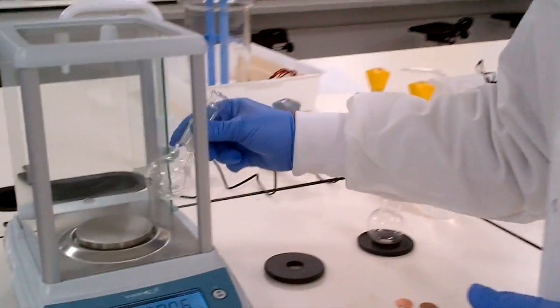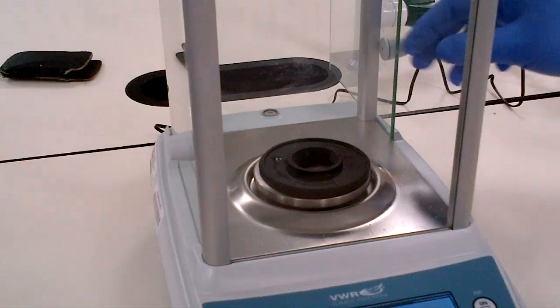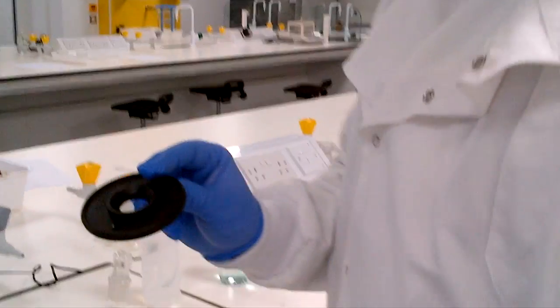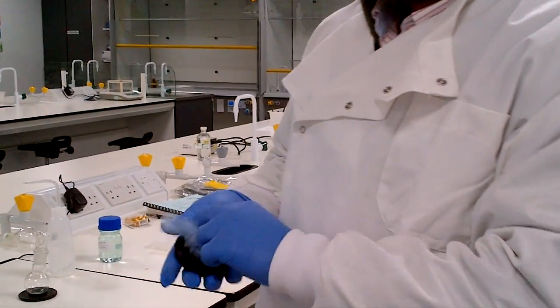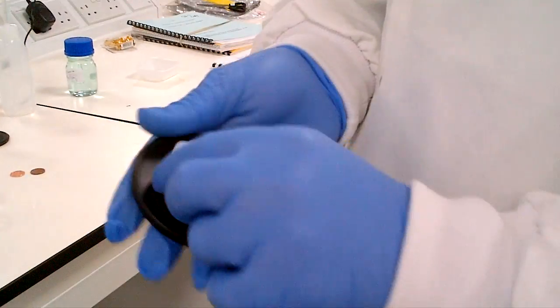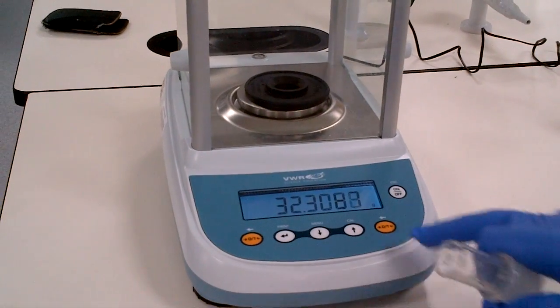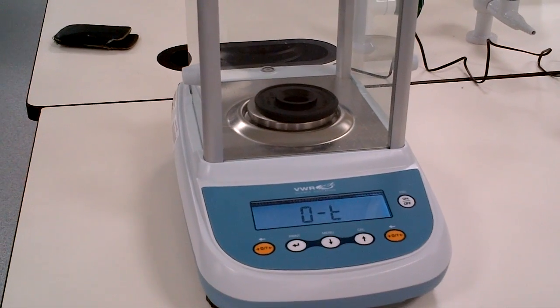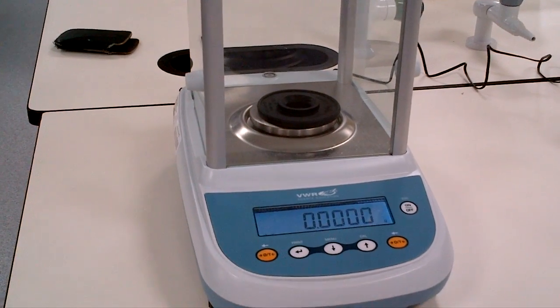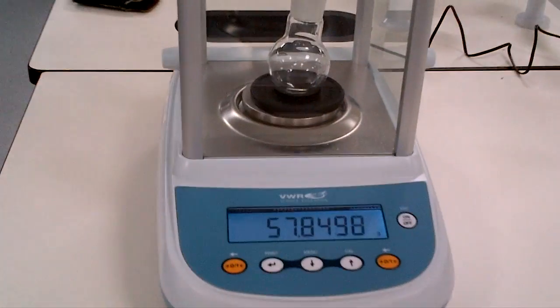You can't weigh a flask like this onto the balance, it will wobble. So what you should do on the balance is to place one of these rubber bungs. This one's a bit wet to start with, so we'll just grab some tissue paper and make sure this is dry, there's no liquid or moisture on this bung. You could be given a cork bung. Tare the apparatus to 0. Eventually it will come up to 0. Weigh the mass of the flask and stopper.